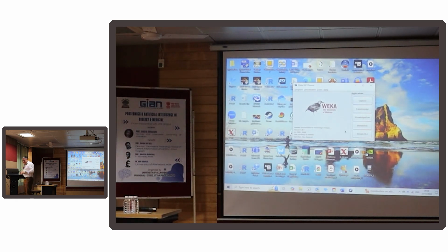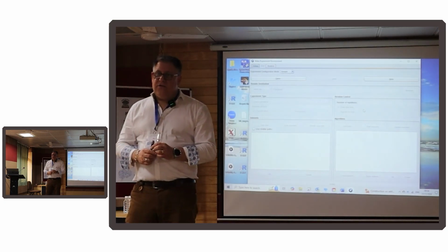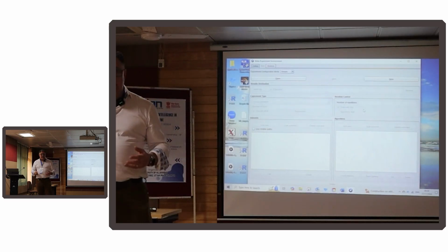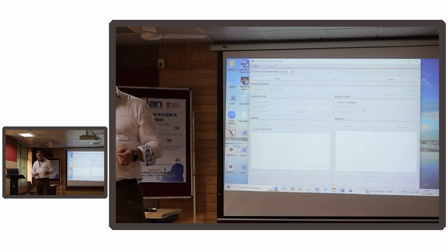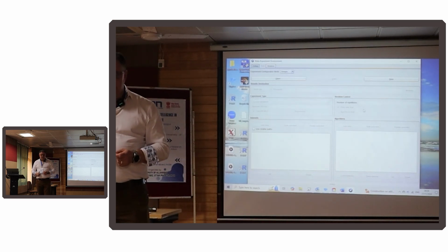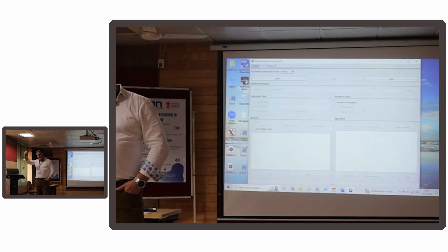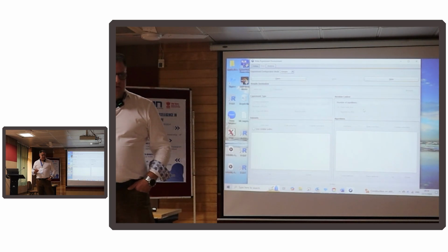So I'm now going to get back onto looking at that data set that I mentioned to you. So instead of using Explorer, we use for that Experimenter. Explorer is very much about you learning to use the algorithm, trying things out in a small scale. Experimenter is about running multiple algorithms for multiple data sets. So you can run Experimenter on 20 different data sets with 20 different algorithms and find the best results. It's a way of automating the whole process.